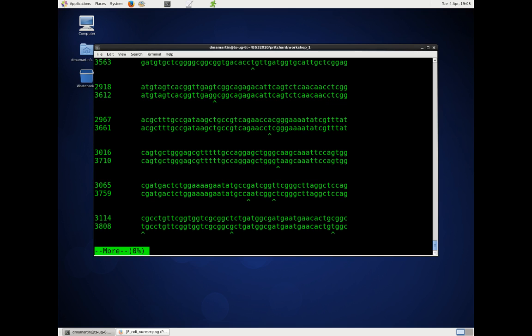Right, so far we have been looking at the raw alignment data, and actually what we probably want to do is to filter that a bit. So remember we talked about reciprocal best BLAST hits. Well, for this alignment what we want to do is just restrict this to that, so that we can map each position in the query only to its best match in the reference, and match each position in the reference only to its best match in the query.